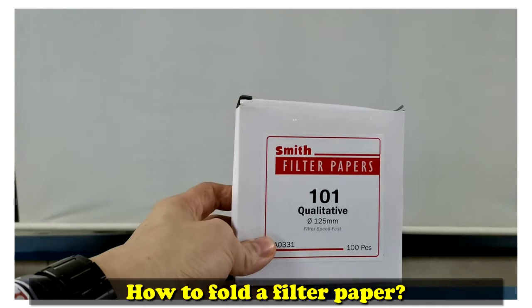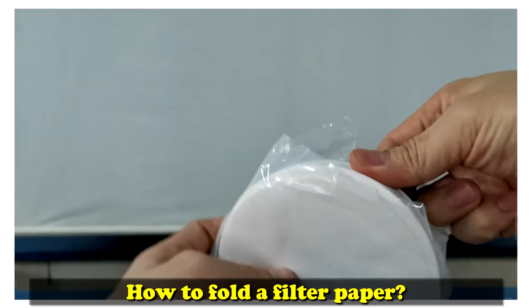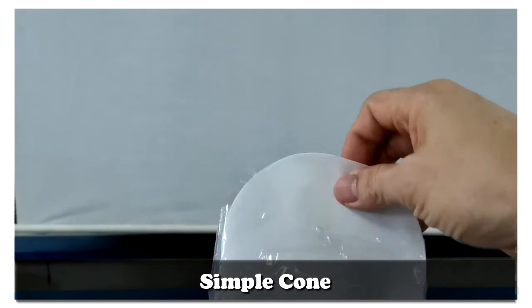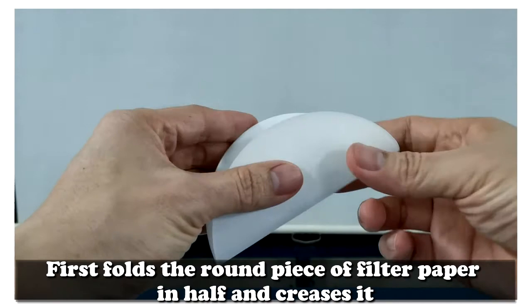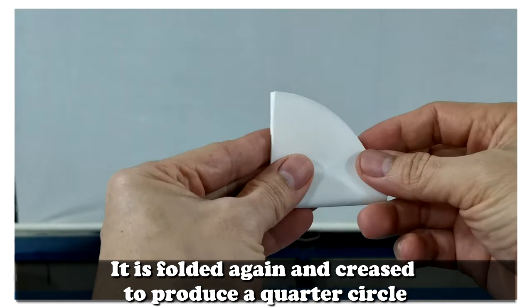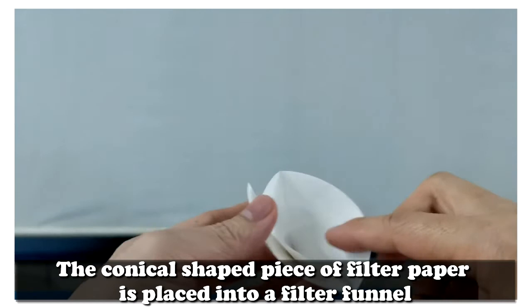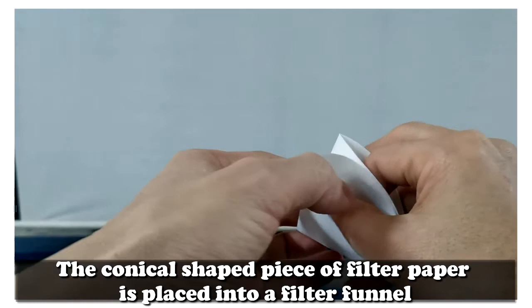How to fold a filter paper? Simple cone. First, fold the round piece of filter paper in half and crease it. It is folded again and creased to produce a quarter circle. The conical shaped piece of filter paper is placed into a filter funnel.